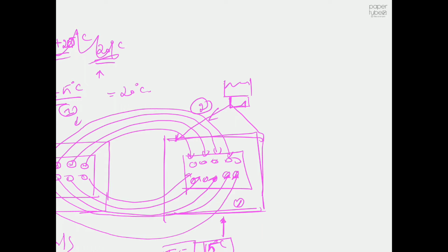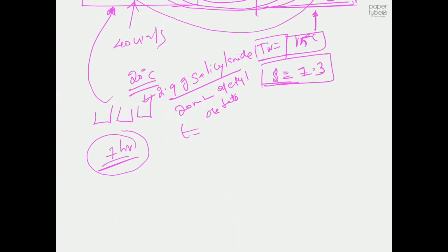So you can go home if you want. You can come the next day and check the film. You can play the recorded video and calculate at what time you started your agitation, say time t equal to 0. From there we can see at what time the first vial nucleates, what time the second vial nucleates, at what time the third vial nucleates, and so on.